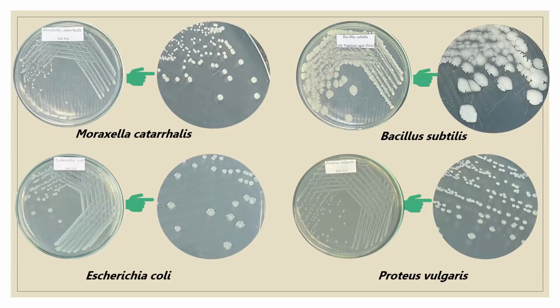For these experiments, I would like you to look at the laboratory report form. You will need to observe the bacterial colony on the plate and then record the size, the shape, the color, and other characteristics of each bacterial colony in your table.